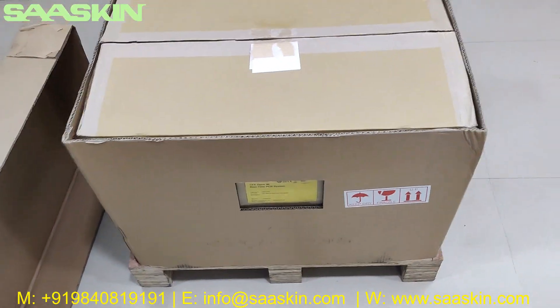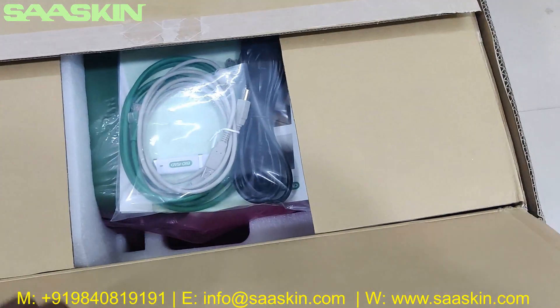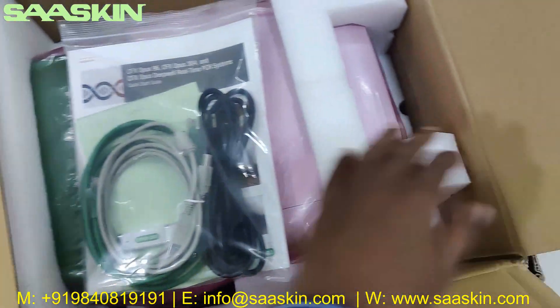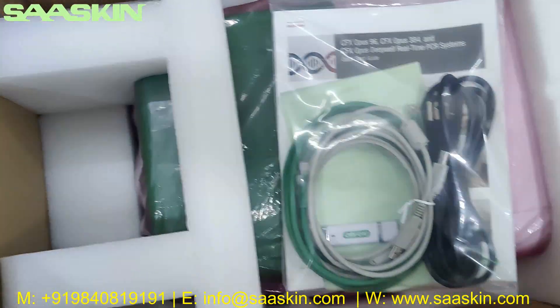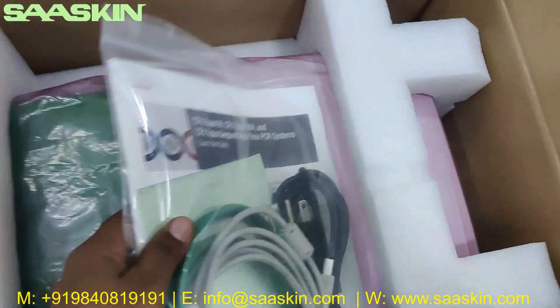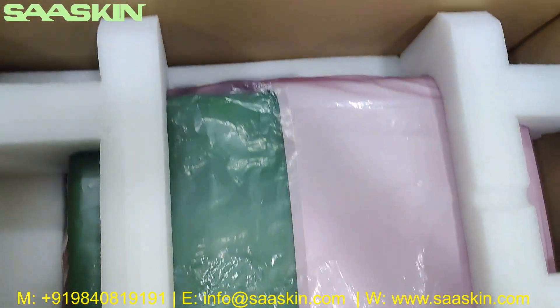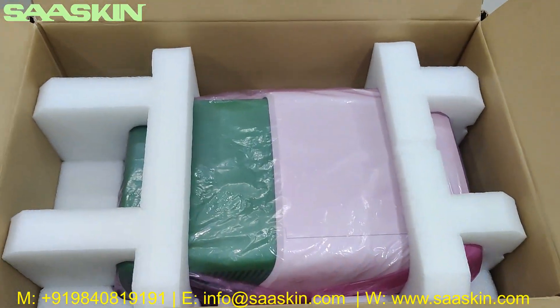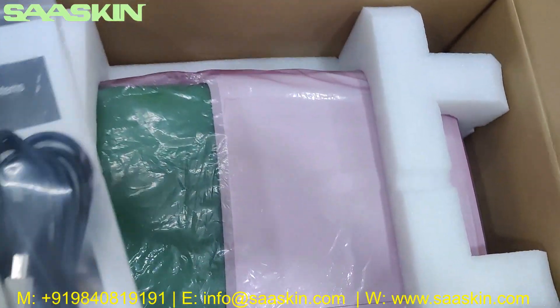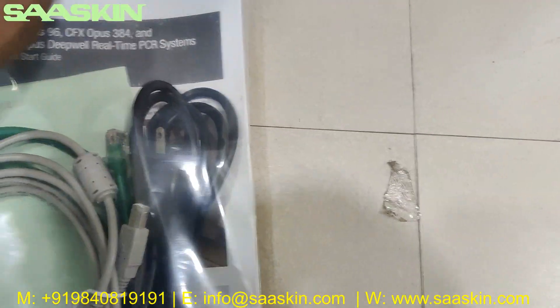If you open the outer box, you will have another carton packed inside. Inside you can see there is a pouch along with the contents. The machine is packed very safely with good support from the pallet — it's very well packed.